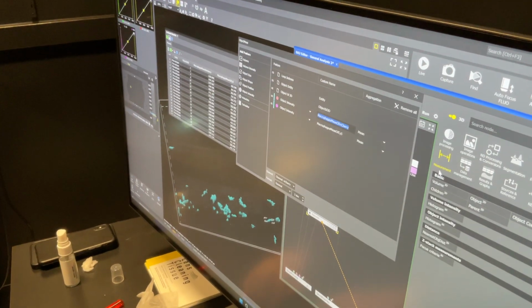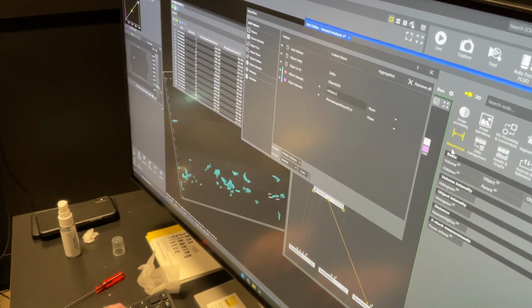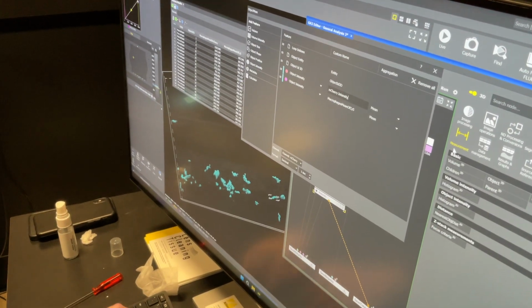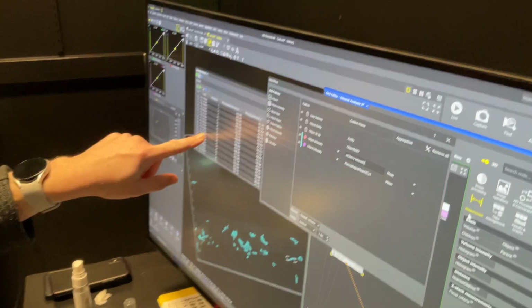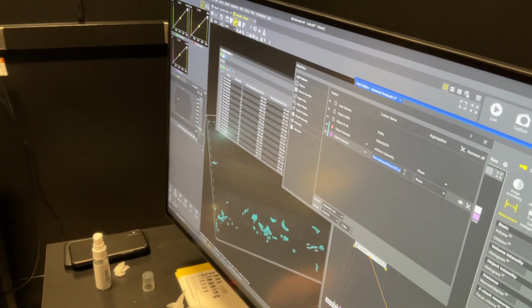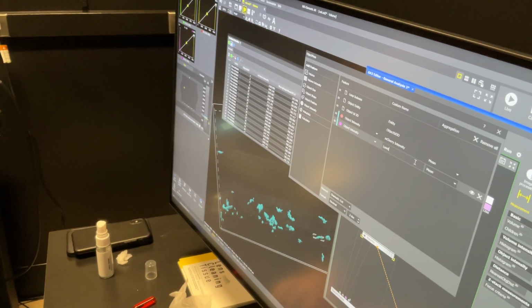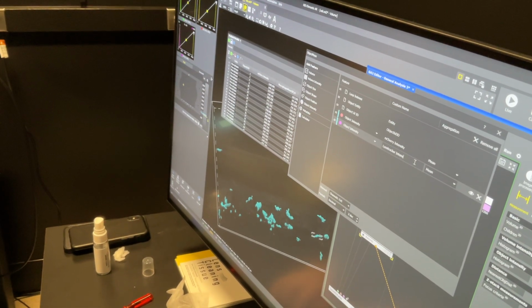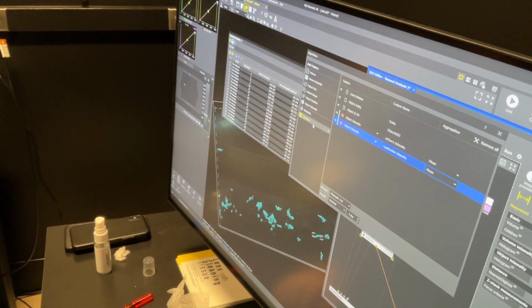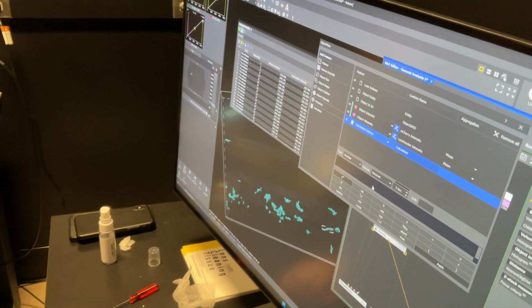So we can say like macrophage mCherry intensity, because we already know it's a macrophage entity here. So it just depends on what you want to do. And this is Lyso tracker intensity. And then you could do, if you wanted to, can we do this at this point?